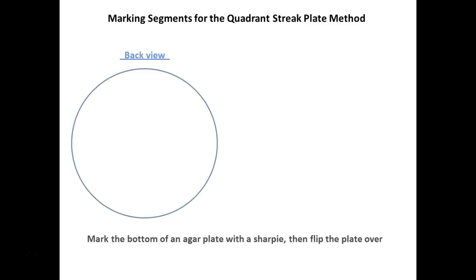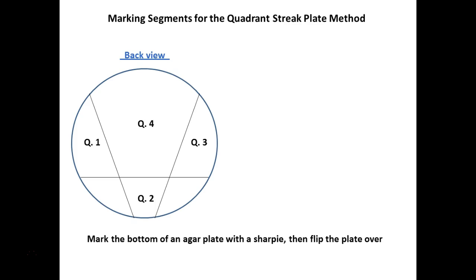So Peter is kind of fancy. I don't do these diagonal lines. Actually, I don't truly do lines anymore because I've done this enough. I don't need guidelines, right? But we'll have you guys draw some guidelines. You can choose how you want to set up your guidelines for your different quadrants. And I'll give you guys different tips and tricks for setting up your plates.